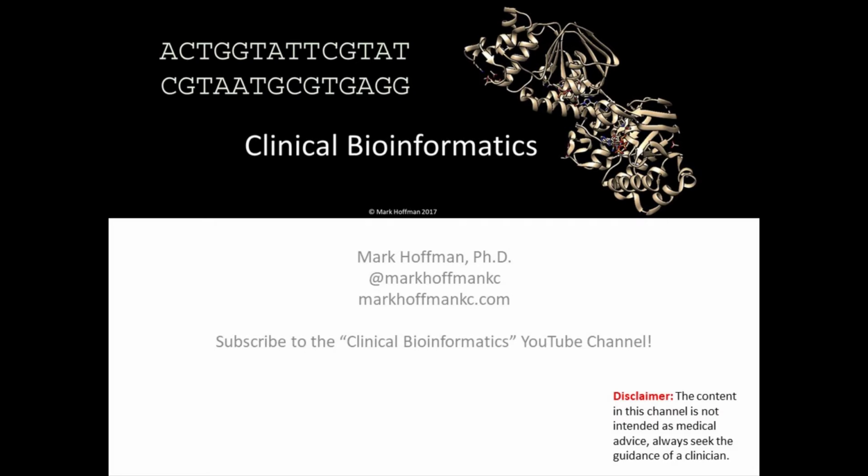In this session, we've learned how to navigate the RefSeq information as it pertains to translating nucleic acid sequence into protein. We've also learned how to use a bioinformatics application to identify an open reading frame and translate that sequence into a protein sequence.